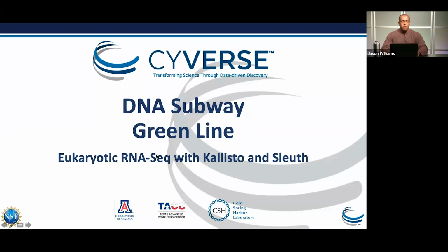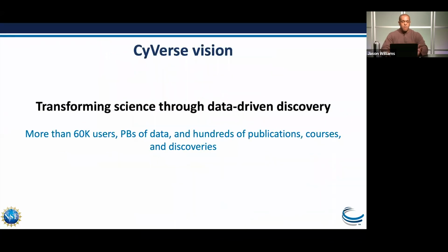Okay, so as you may be familiar with, this project is brought to you by CyVerse, which has the mission and the vision of transforming science through data-driven discovery. Some of you may have only really used some of the capabilities of DNA Subway and not known about the other things that are available to you, CyVerse. Towards the end of the presentation, I'll give you a little bit of detail of how Subway connects very nicely to the CyVerse resources.